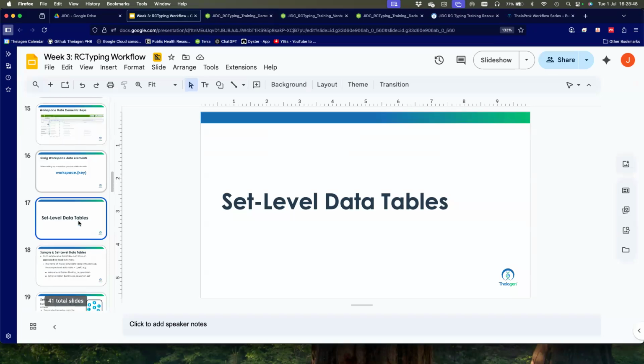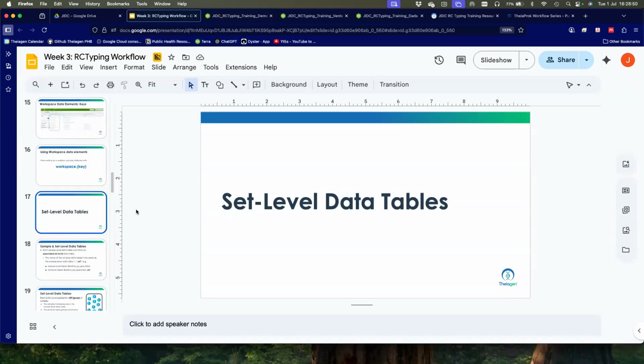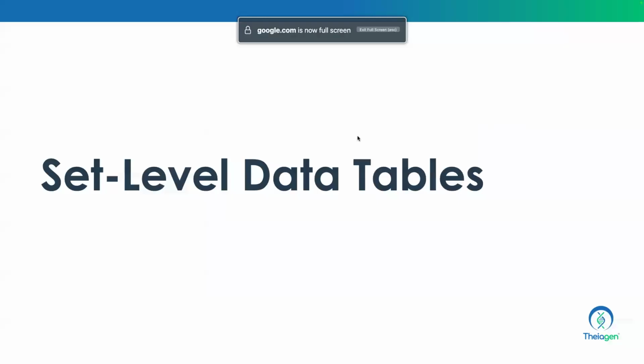Okay, are there any questions? All right. We'll see shortly how to actually input the workspace data elements once we get to launching the RC typing workflow.